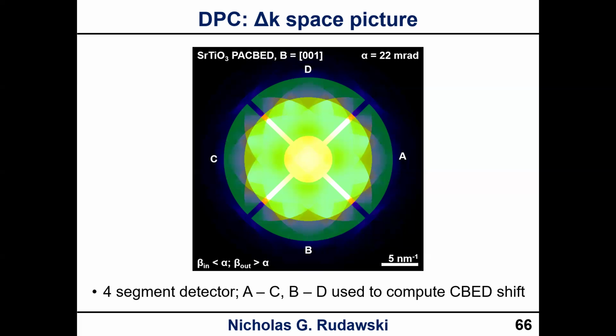The idea is that you don't want to defocus your objective lens by a lot, okay? There's a parameter called defocus, which you can see, and you're trying to keep that as small as you possibly can. If you do it right, you shouldn't have to deviate usually more than a few tens of nanometers, if that. Usually I can do even better than that when I'm doing my STEM imaging.